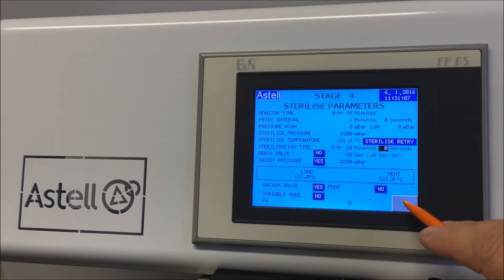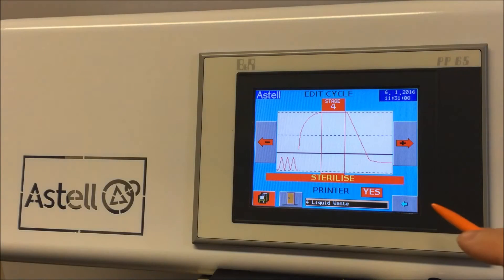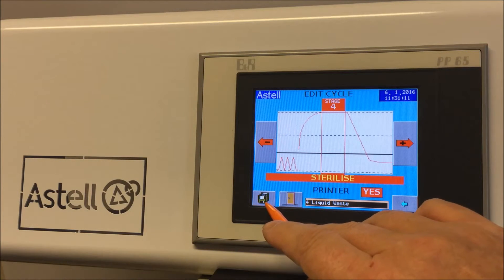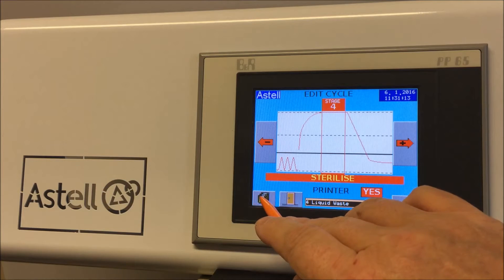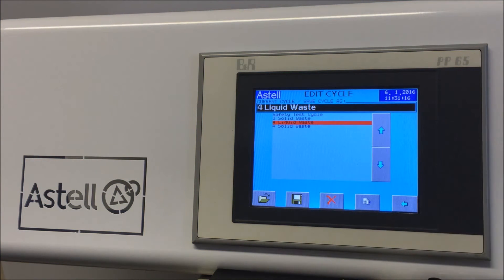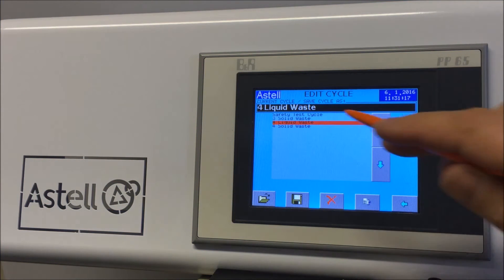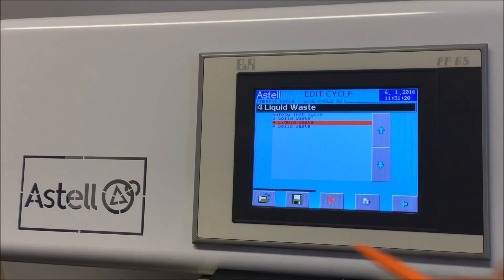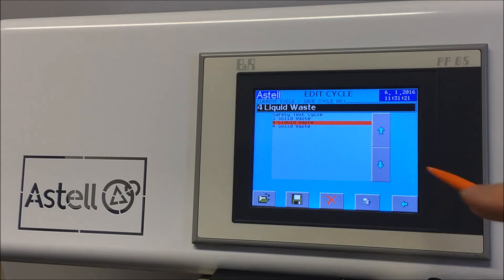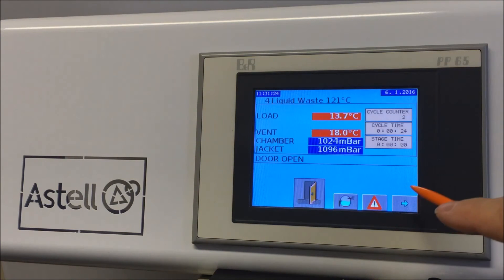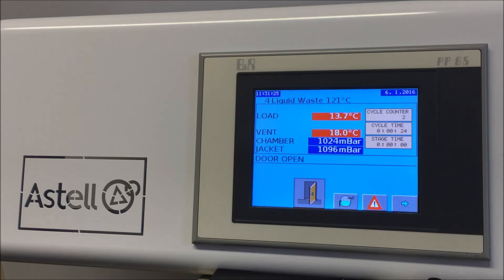Press the left arrow icon on the bottom right of the screen. The save icon on the bottom left of the screen will be flashing red. Press this icon to save your changes. Ensure the cycle you are saving is highlighted in red and select the disk icon to save the cycle. Now press the left arrow icon on the bottom right repeatedly to get back to the main screen.